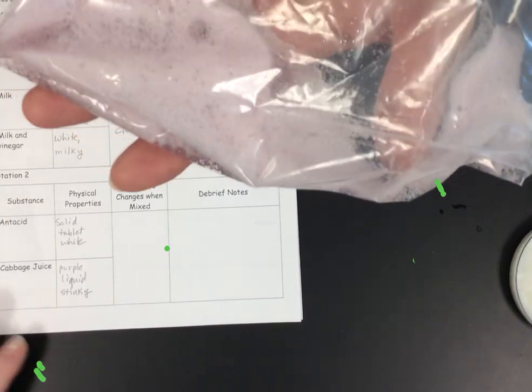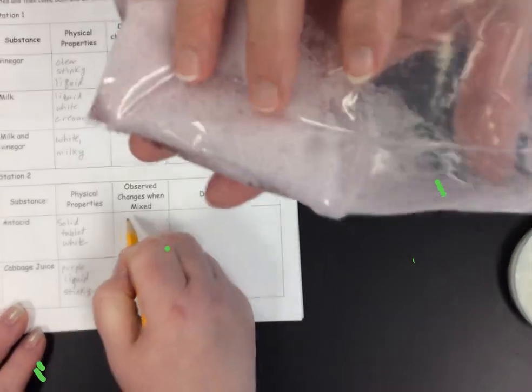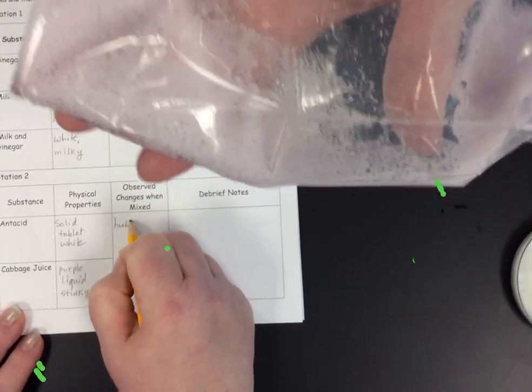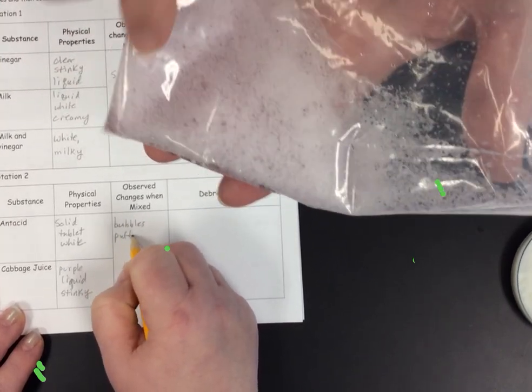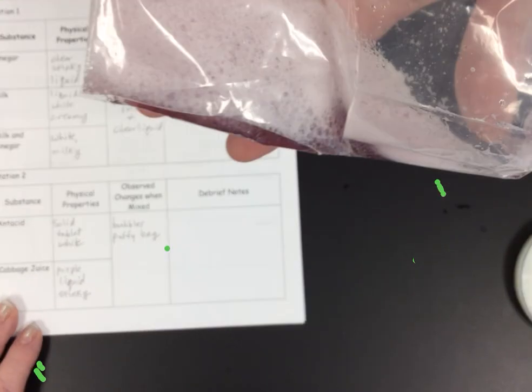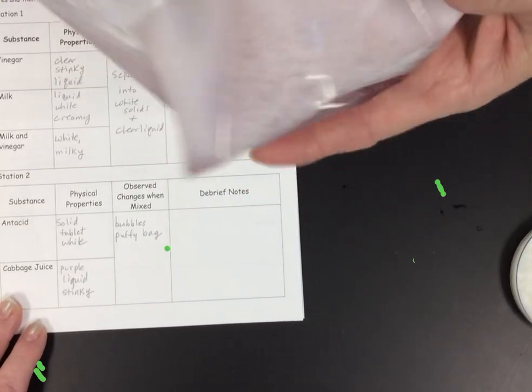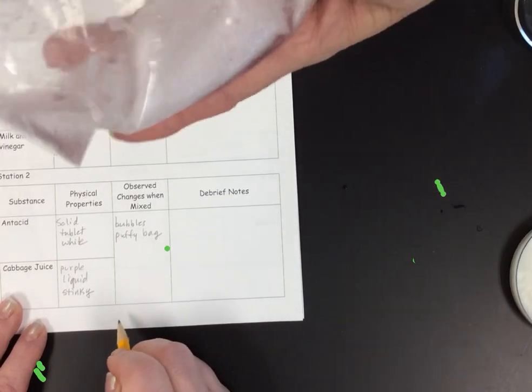Look at that. It is almost all bubbles, right? Also, the bag is puffy now. The bag was flat before, but now it's puffy. The reason it's puffy is because these little bubbles have what we call gas in them. So we have trapped some gas. That is station number 2.